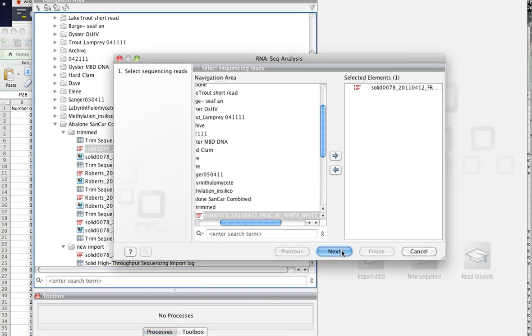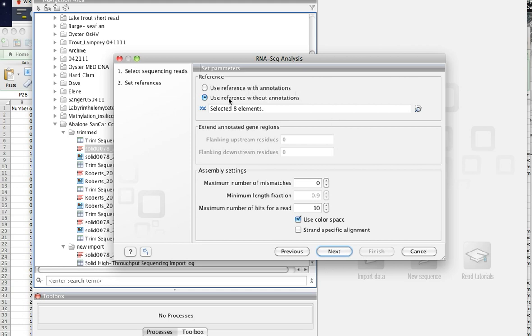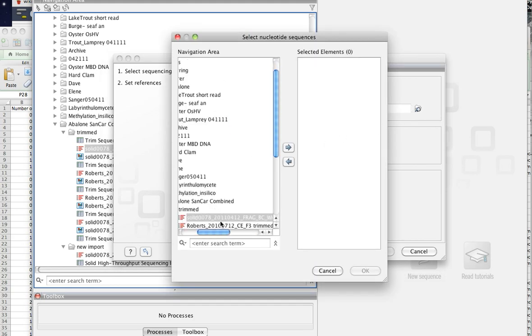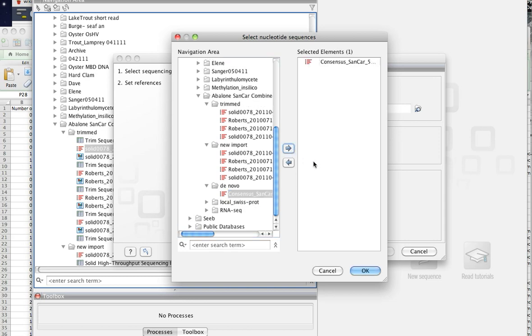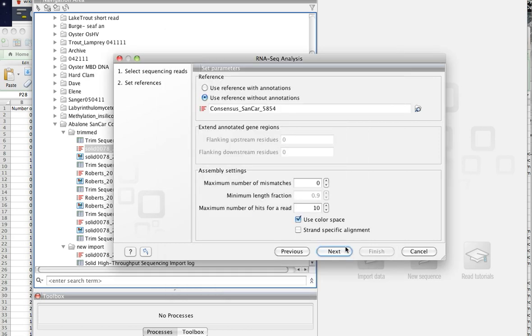Yep, and this is more just a way that the software works. Does anybody besides you know how to do all this stuff in here? Everybody in my lab better know how to do this. Sam does? He should, yeah. What about all your minimum, maximum settings? There's no magical stuff here. Basically, we really just do it, and if we don't like it, we do it again, and we talk. Okay. So the maximum number of mismatches.